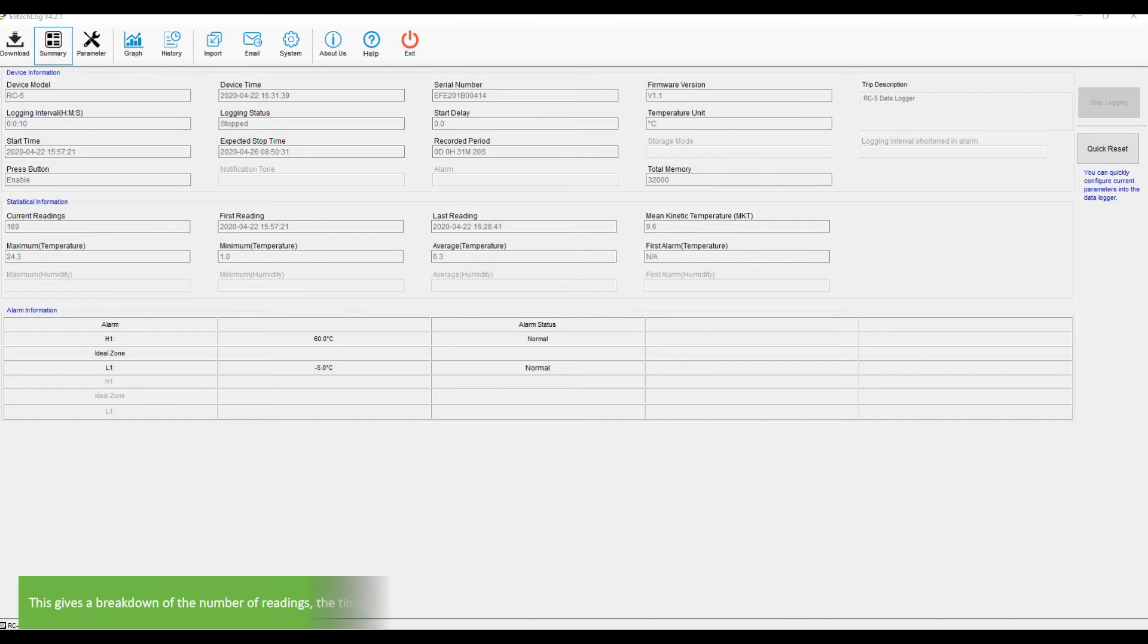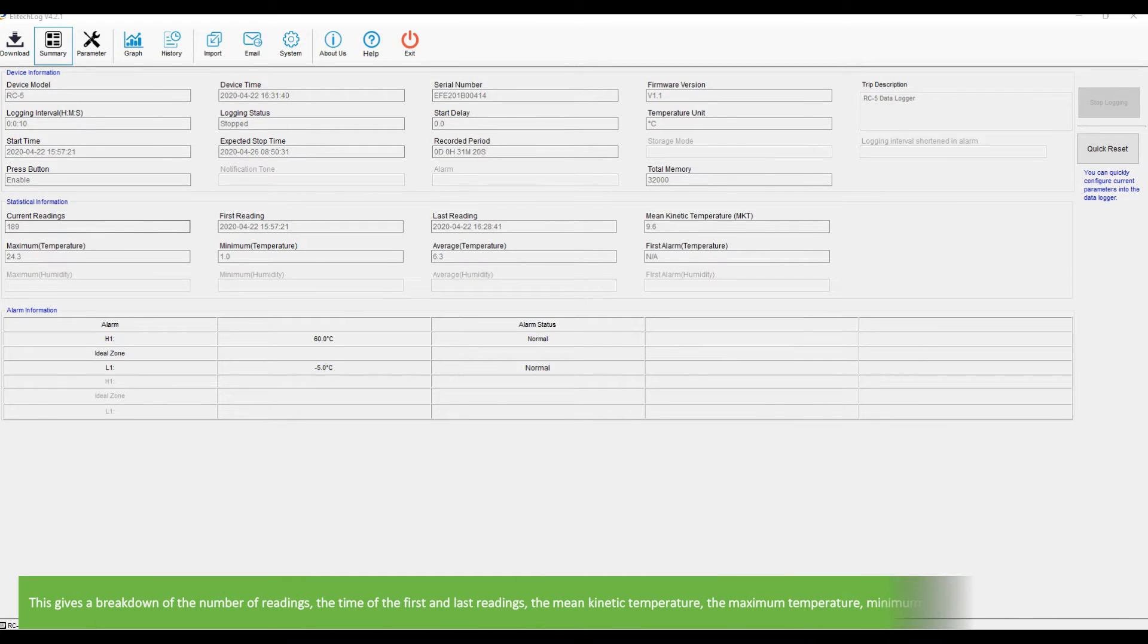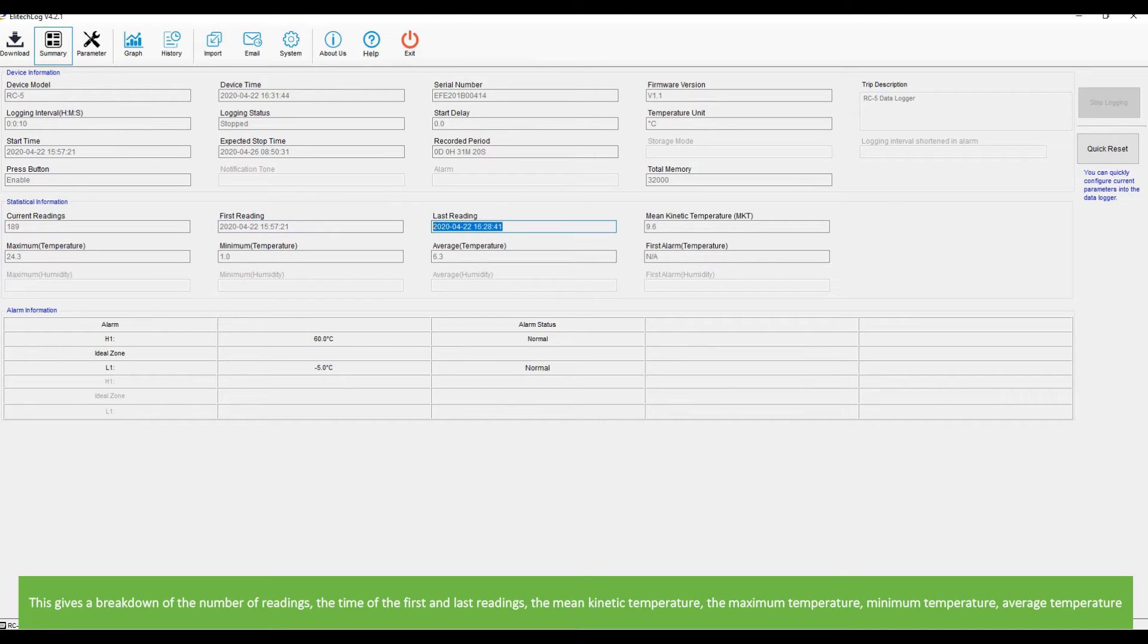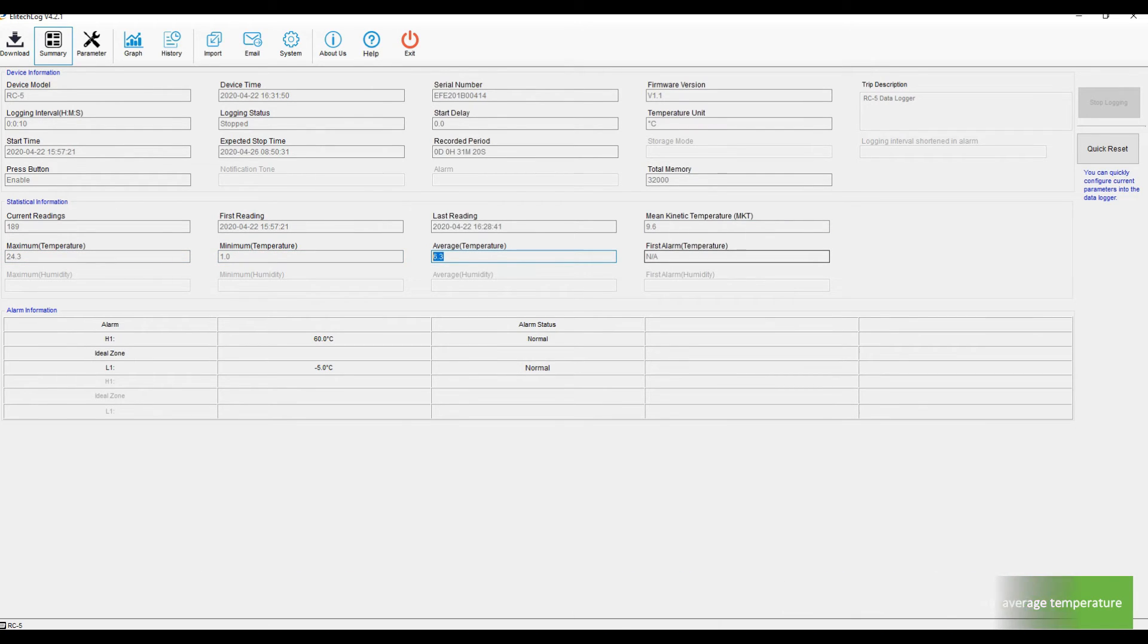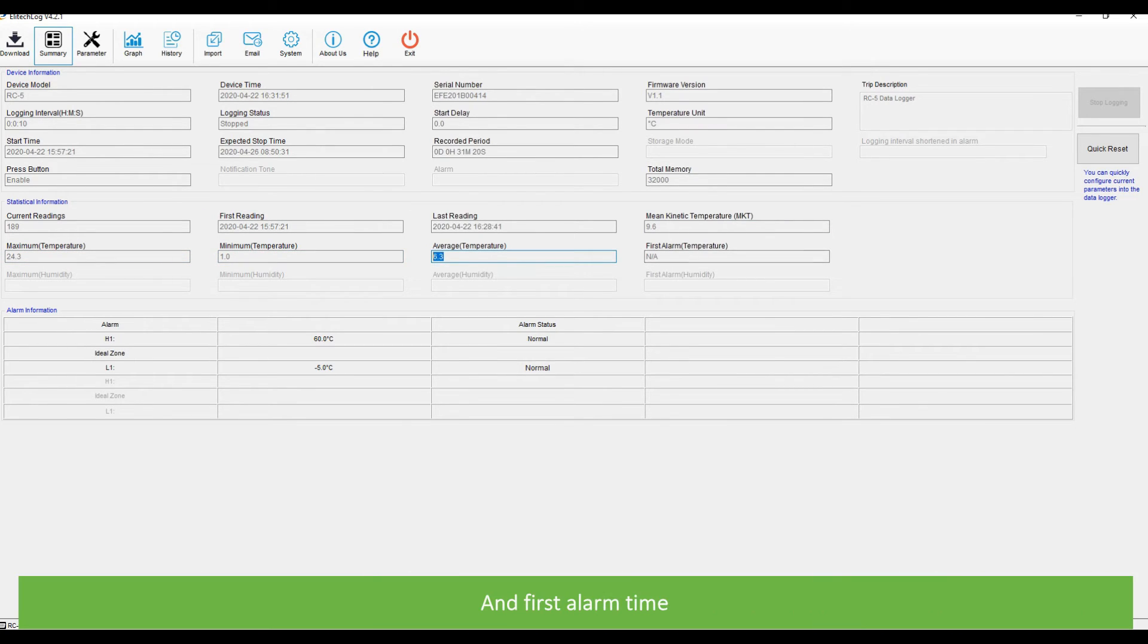This gives a breakdown on the number of readings, the time of the first and last readings, the mean kinetic temperature, the maximum temperature, minimum temperature, average temperature, and first alarm time.